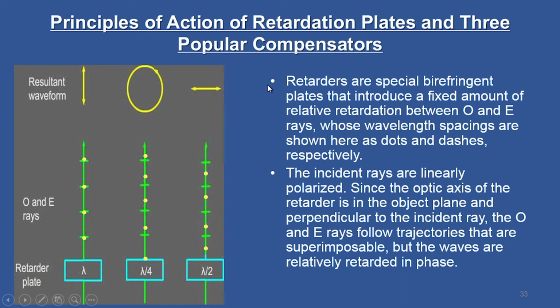So, I just mentioned the retardation plates. Let us see what are the principles of the actions of retardation plates and the three popular compensators. The retardation plate or compensator, they are one and the same. So, look at this schematic. Let us look at the remarks first and then we will get into the details of the schematic.